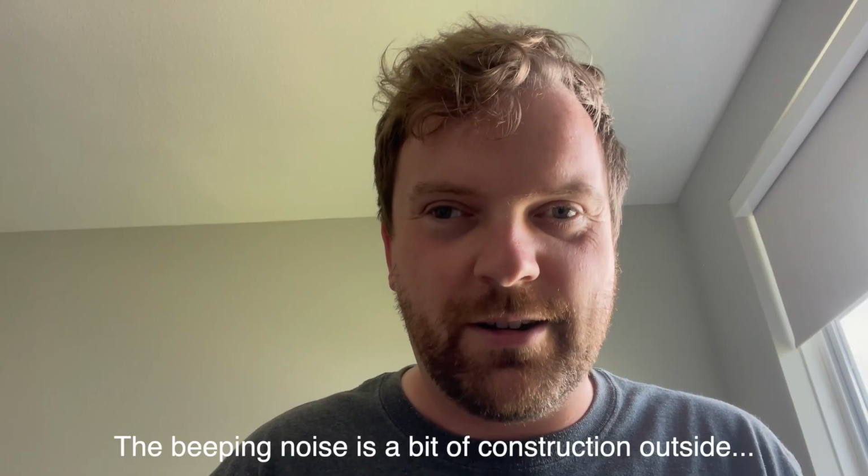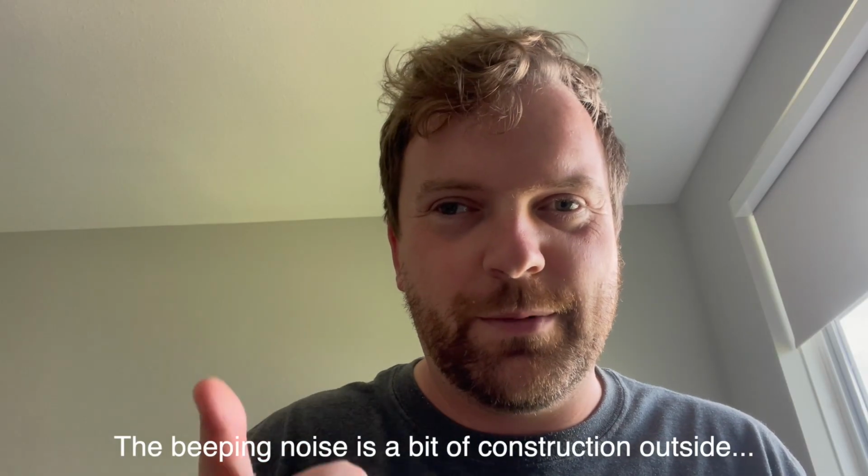Hi everyone, this video is going to be a quick overview of what stirred tank bioreactors are before we get back into looking specifically at the Pluri Bioscience bioreactor. And I want to create this video because stirred tank bioreactors are the industry standard right now, both in the pharmaceutical industry and also they're just being ported over in a sense to the cultivated meat industry.